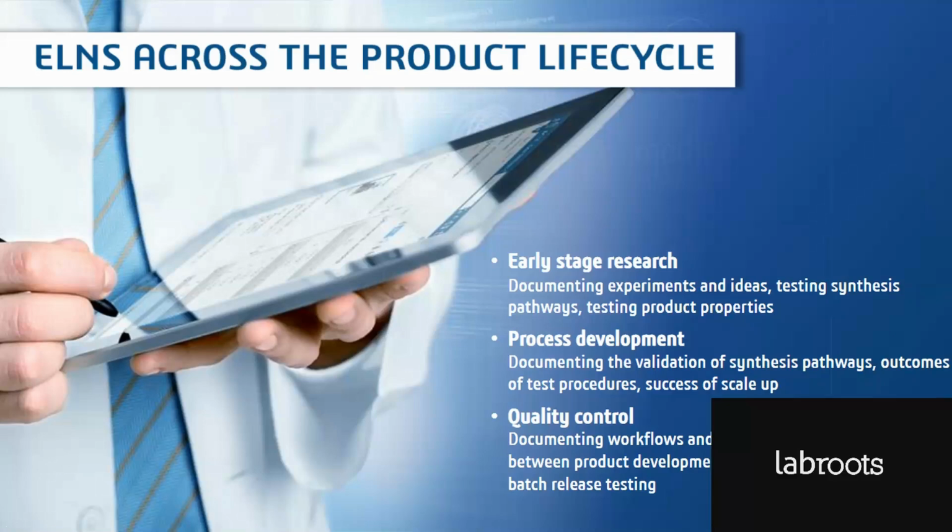In quality control, there are more rigid testing procedures and batch release tests that are necessary. And so a lab execution system would probably be in place. But an ELN could be used to help manage the workflows and the overall project progress again. And it also helps create the link between commercialization and the initial product development work.